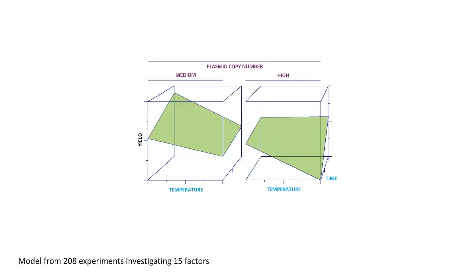And without high-dimensional integrated experimentation, there was no other way to have possibly unpicked this. And to be clear, getting these factors right was the difference between that 200-fold yield improvement and about half that in the average case, and if you got them wrong, being on the edge of what we call a design cliff, getting absolutely nothing out of your biomanufacturing process.